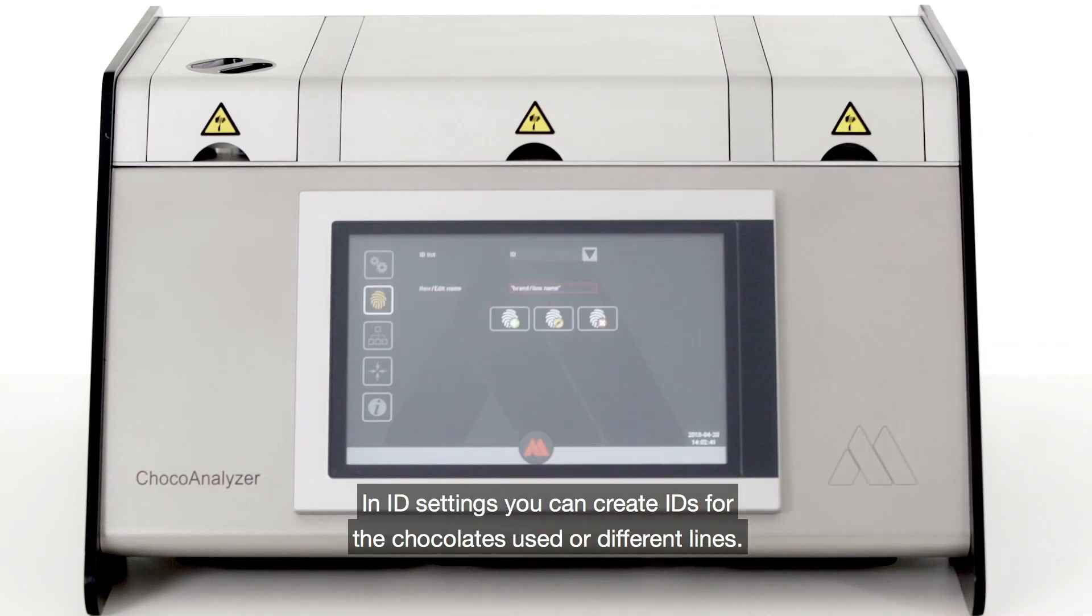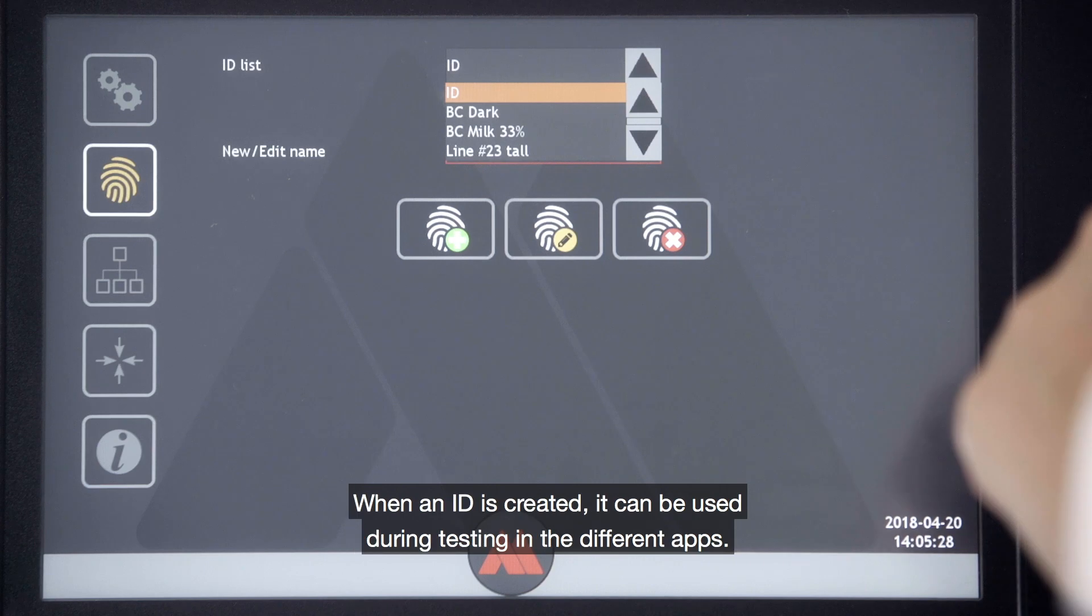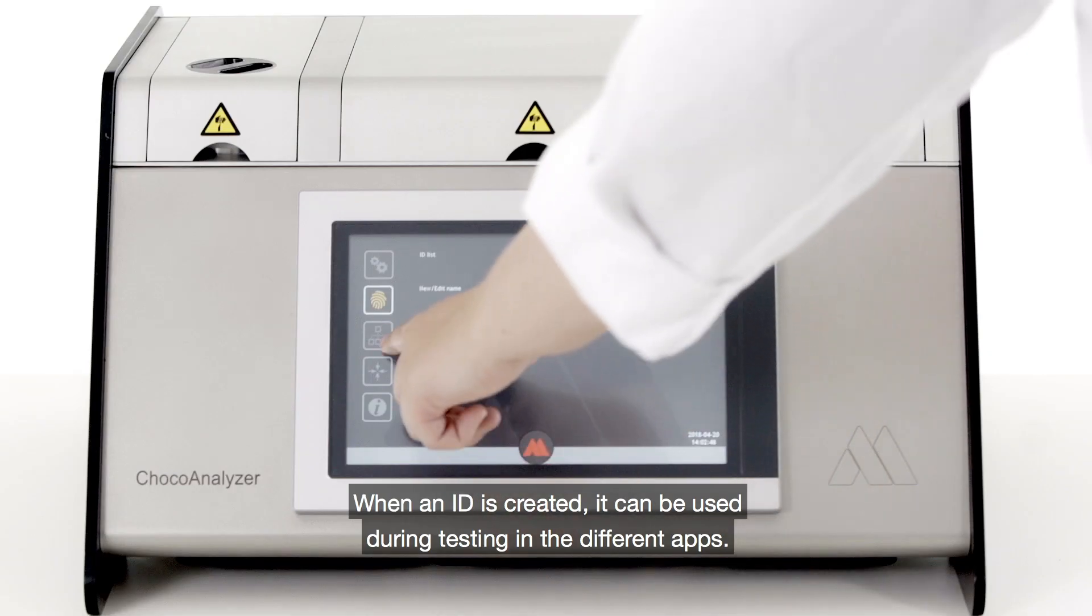In ID settings you can create IDs for the chocolates used or different lines. When an ID is created it can be used during testing in different apps.